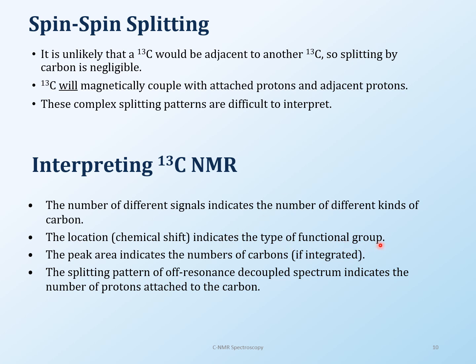A lot of times you need something else to help you with the carbon 13 NMR, like proton NMR or IR or something like that. But sometimes you can figure out the structures yourself also. With a simple molecular formula and simple NMR, you can do it.